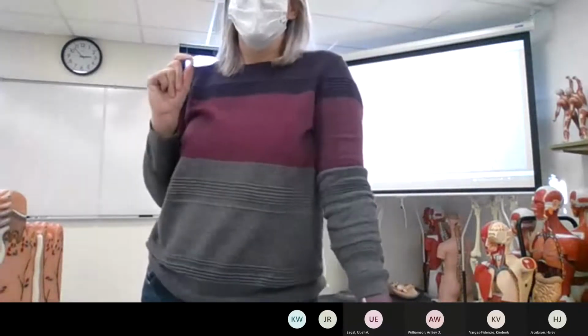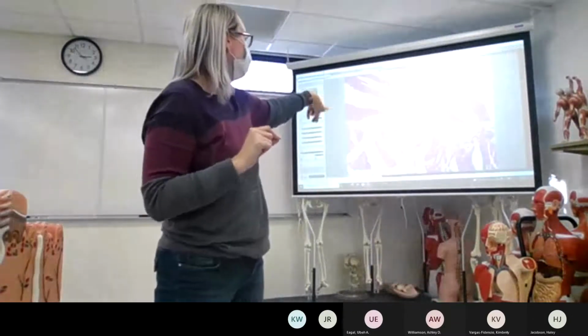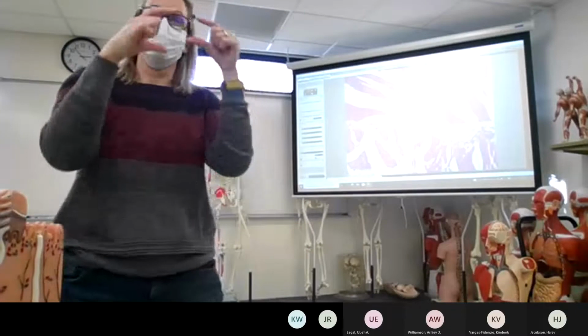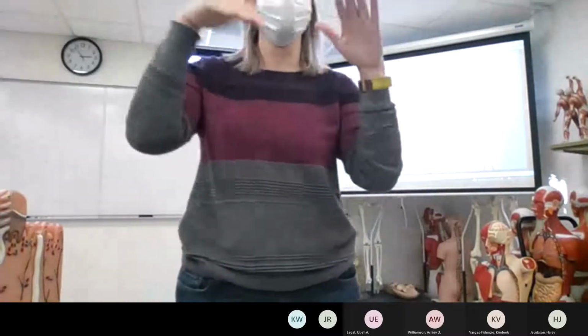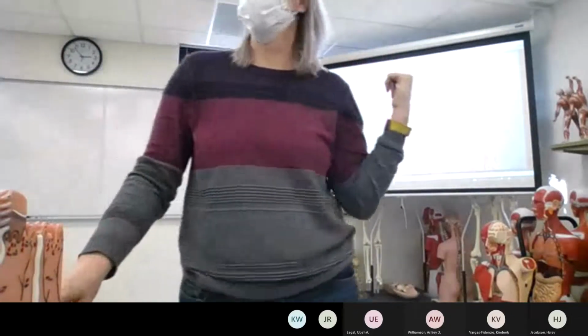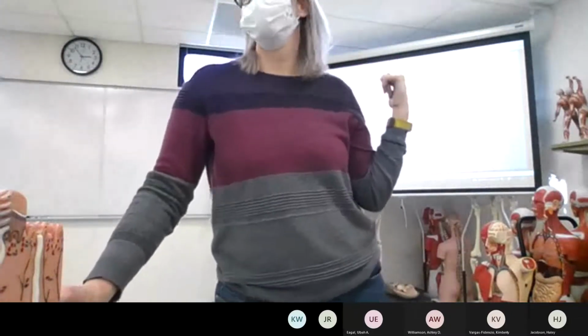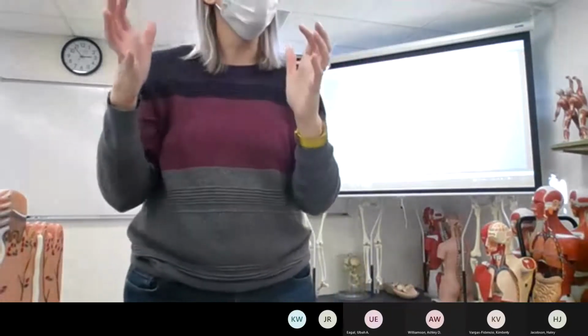All right, so smooth muscle. Again, it shows red, it shows pink. It's individualized cells. These cells can touch each other. There can be push in by blood vessels. It can be really challenging to tell: is that dense irregular, dense regular? Is that smooth muscle? So you want to look for clues.